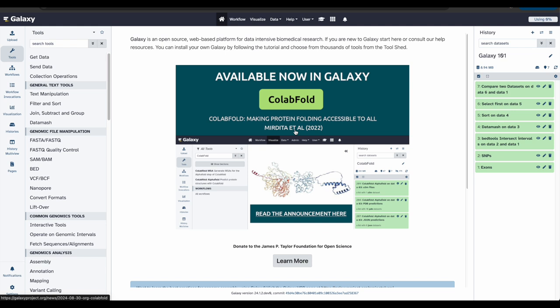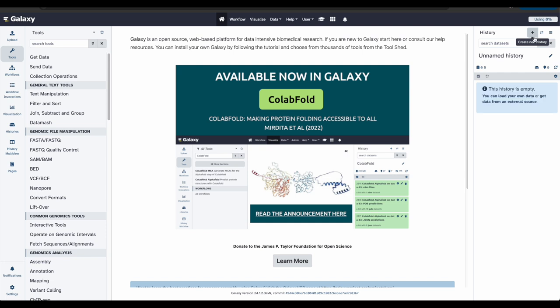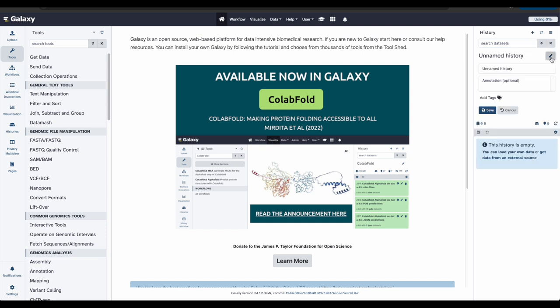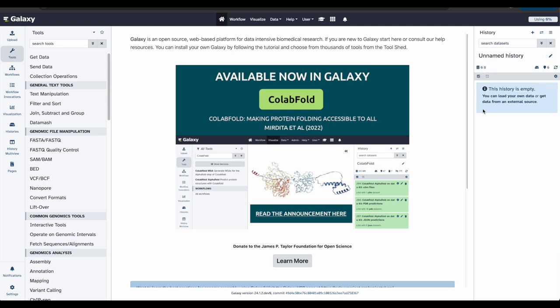Now that we have built and saved our workflow, let's use it on some different data. For example, let's find out which exons have the highest number of repeat elements. So let's start by creating a new history. And of course, let's give it a name. For this one, I'm just going to call it Galaxy 101.2. And save.